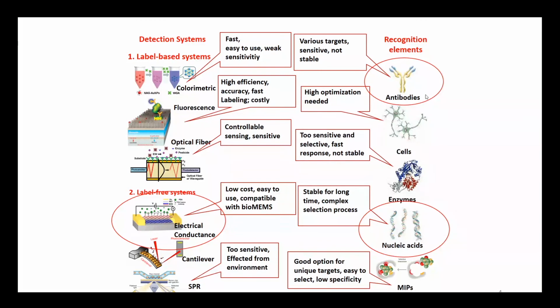So because of this, if we need to use antibodies as biorecognition element, we should keep our system in 4°, or we can just use them in pH 7 to 7.5 kind of range, because the antibodies themselves, they are sensitive, but they are too sensitive for their target molecule. They have like 100% binding capability for their target molecule.